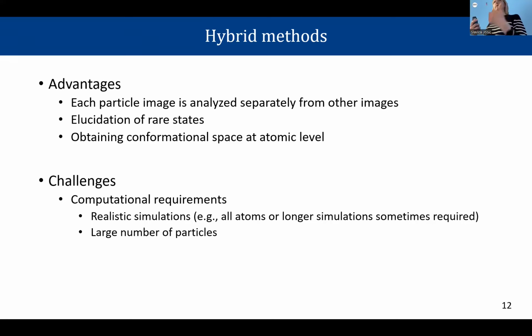Because if you use classical CHARMM potentials and all atoms, then yes, maybe you will need a longer simulation, and maybe you would get lost on the way and never reach this state in the data.